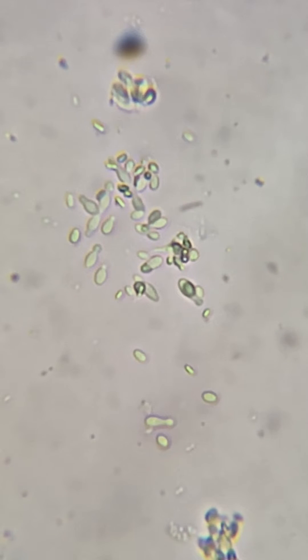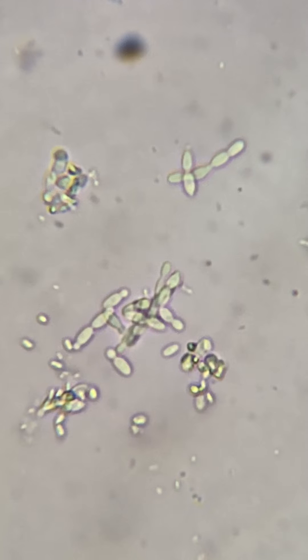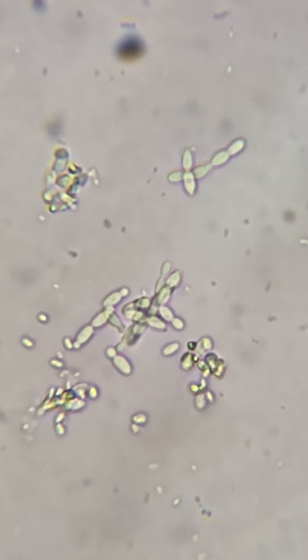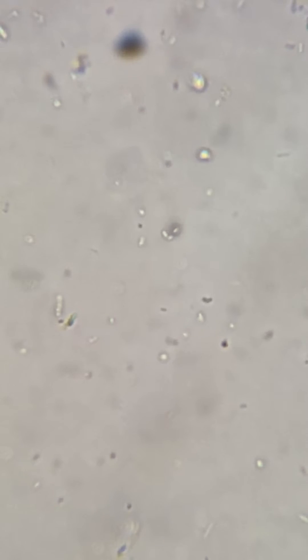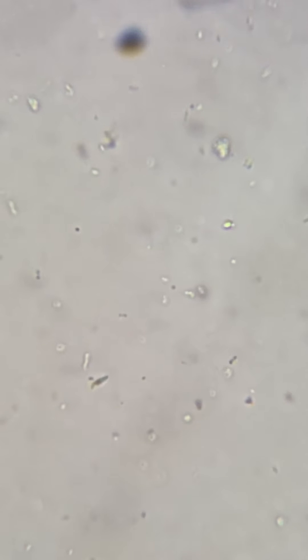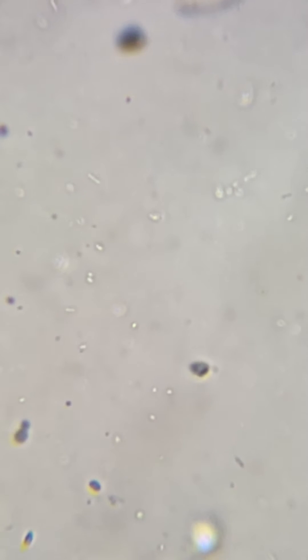These look like some really small budding yeast — a lot smaller than when I normally see Saccharomyces cerevisiae. The yeast appear to be mostly oval-shaped, and their budding is end-to-end. Unlike Saccharomyces cerevisiae where it can bud wherever on the cell, this only buds at the ends. I'm also seeing a lot of bacteria, some of which are little spherical-shaped, some end-to-end linked spherical shapes.